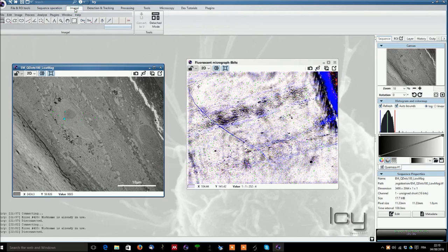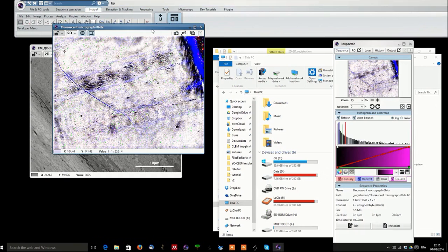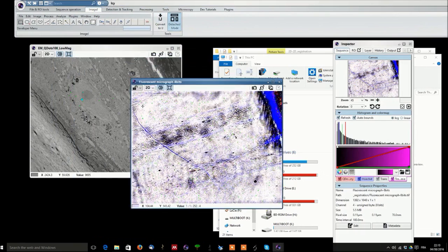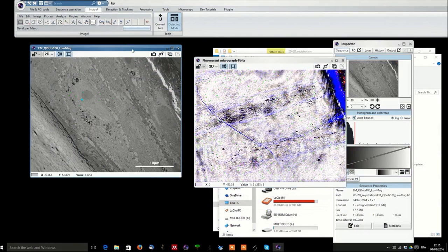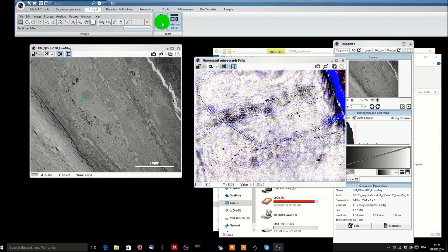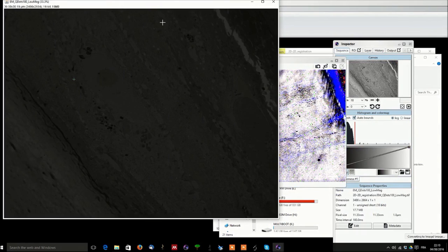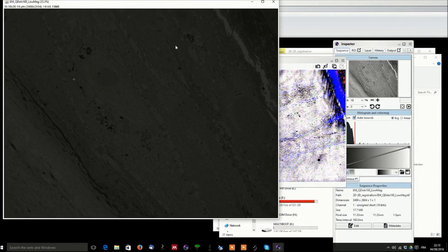From there you can go into detached mode where pictures will be separated from your window and you can convert your image like this one into ImageJ format. As you can see it opens in ImageJ.